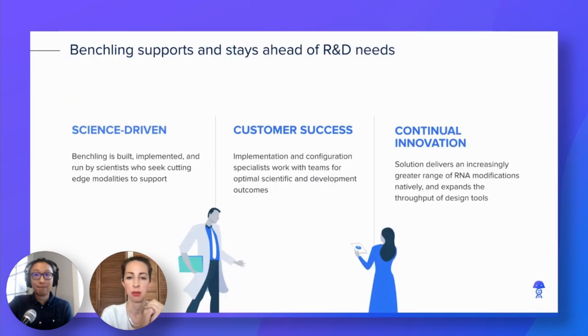I wanted to mention that we are here to support and stay ahead of R&D needs for this modality, as we are with all of our modalities. And so as much as these are the core values across all of Benchling's capabilities, it's essential in our work with RNA therapeutics companies in particular to note how science-driven, customer-centric, and growth-oriented we are in support of your particularly dynamic space. Benchling created this functionality in partnership with researchers focused on RNA to deliver on the specific needs of this hybrid modality. We will continue to stay ahead of the needs and evolve the product as the science itself continues to transform.